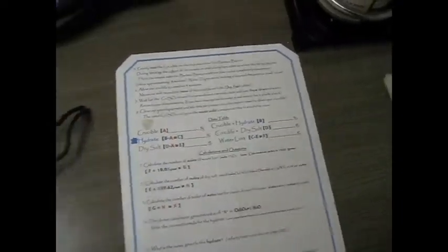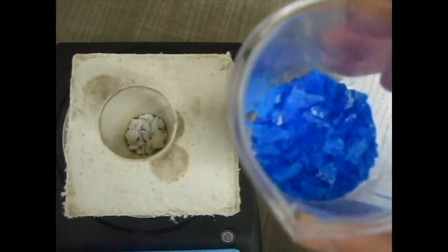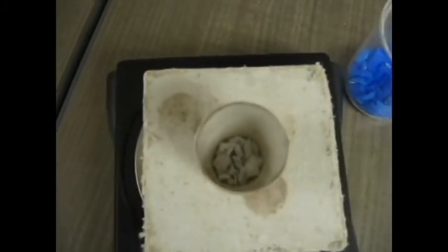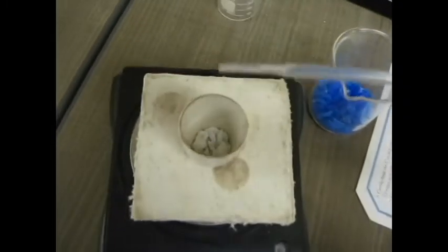But since we lost water, we were kind of mean. We took this beautiful blue chemical. Look, we took this beautiful blue chemical and turned it into that. Kind of sad, right? Okay. Now we're going to give some of that back. We're going to add a few drops of water, just very few. Watch what happens.